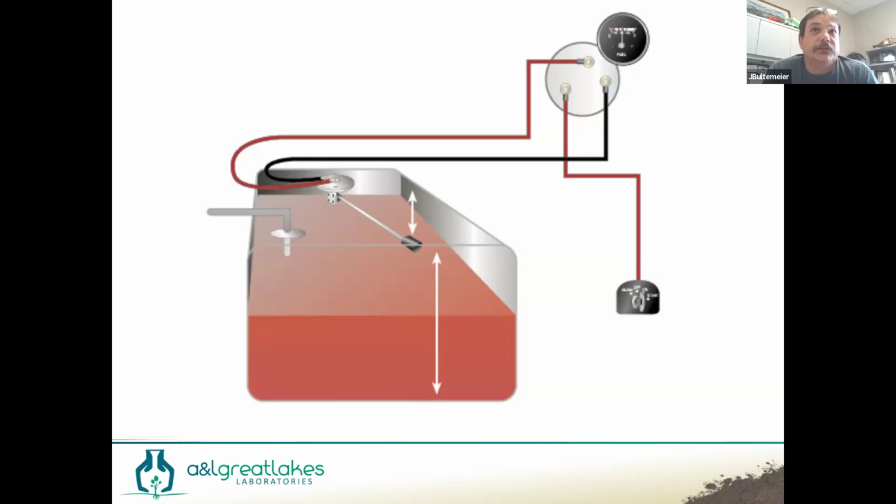We also know through research that if that number is up over 80 to 100 parts per million for phosphorus, for example, we can leach it. It can actually be so high that the soil can't hold on to it. It can actually leave the soil profile. And so this interpretation, this understanding, this research takes an arbitrary acid extraction number and gives it meaning. And so the nutrients in a soil are completely arbitrary. They are an index, but when we apply it to known data, now that index has meaning.